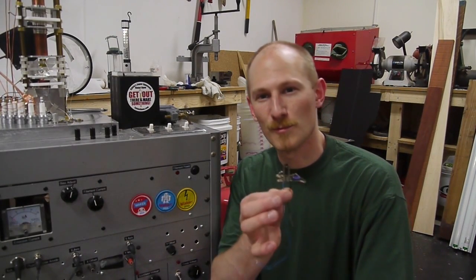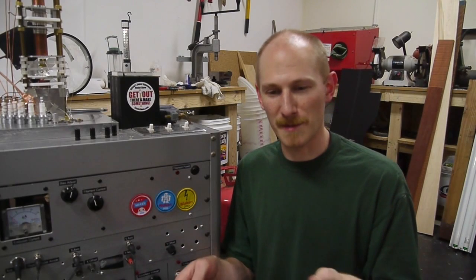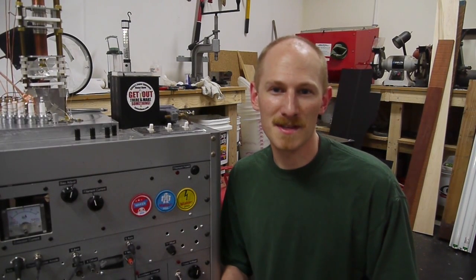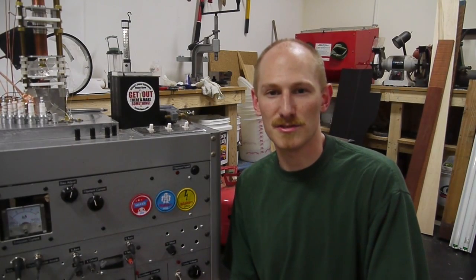The idea is to put a working electric circuit into a scanning electron microscope and then use the microscope to probe the circuit while it's operating. One of the cool things is you can do this with an integrated circuit that you've decapped, and you can see the actual traces inside the IC change charge state.